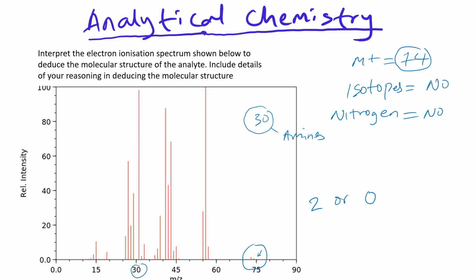Now let us start identifying the clusters and the peaks. Let's look at this cluster here. This cluster has a peak at 56. So we write the peaks.